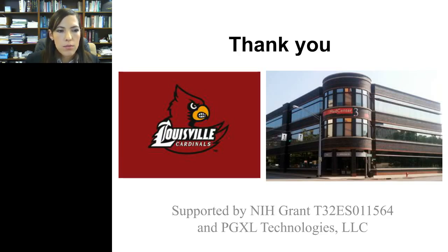And this last question looks like they're asking about next generation sequencing used for analysis of CTCs. And yes, I think that will be routinely used in the near future. There's a question here about sensitivity and accuracy of the DEPArray. So I showed that we have about 85% yield, but we're working on looking at accuracy over many studies for capturing CTCs.